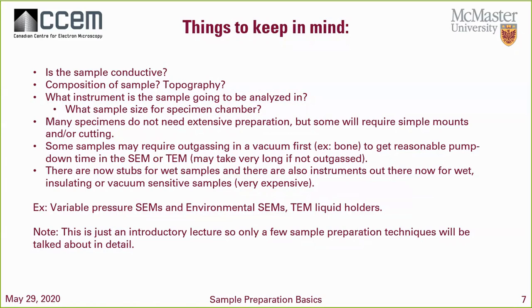And again, some samples just require simple prep, just like mounting or cutting. Now, another thing that I want to highlight as well is outgassing of samples, right? For example, in bone. Now, I'm not going to talk too much about biological samples today, but a lot of the applications of sample prep that I'll be showing today, you can use by taking the proper safety precautions, okay? So at the end of the lecture today, I have a reference that is very good for biological preparation because I won't be covering it too much here.